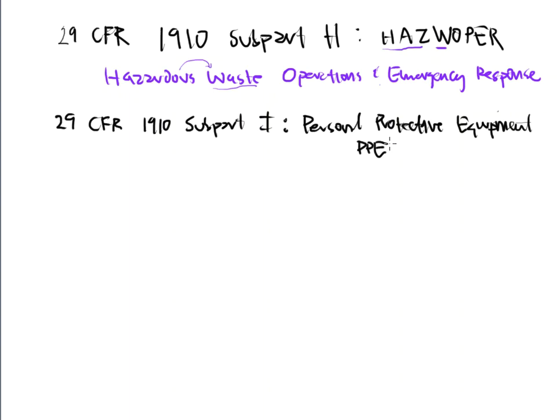So, for example, goggles, lab coats, steel-toed shoes, closed-toed shoes, face shields, all of that would be personal protective equipment. When should I wear it? When should you not wear it? What kind of substances should you wear it around? Who's responsible in acquiring the personal protective equipment, and what role do they play? Both you and your employer.